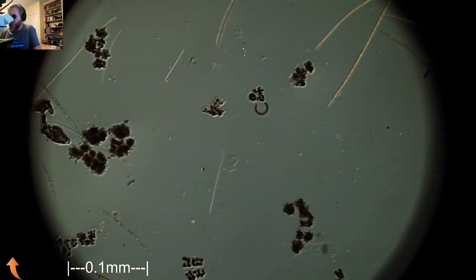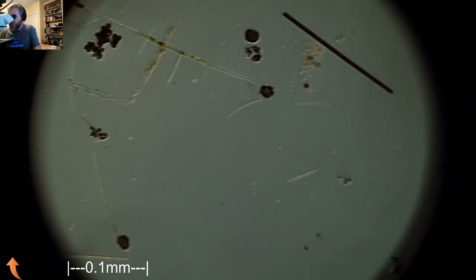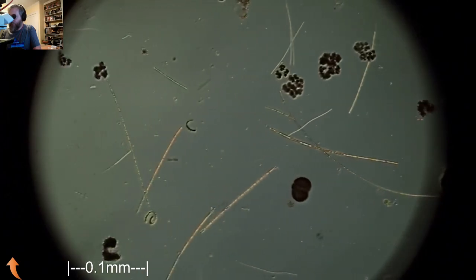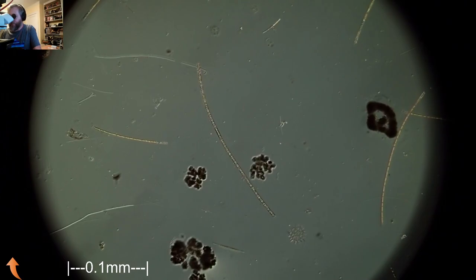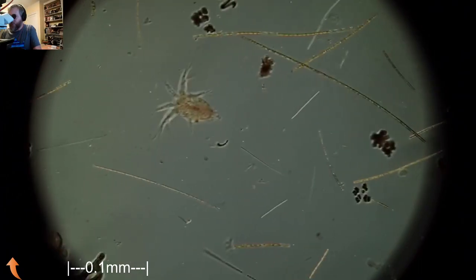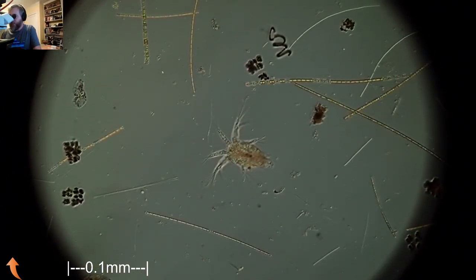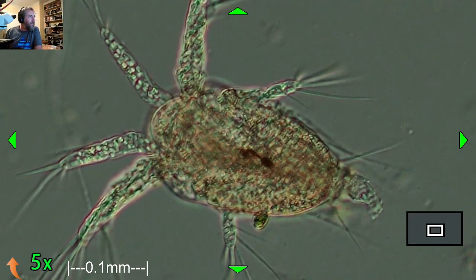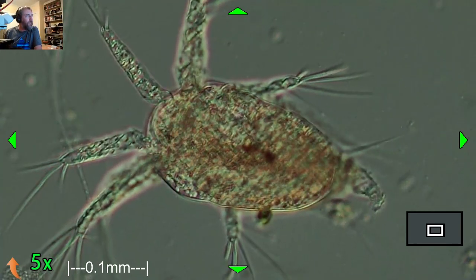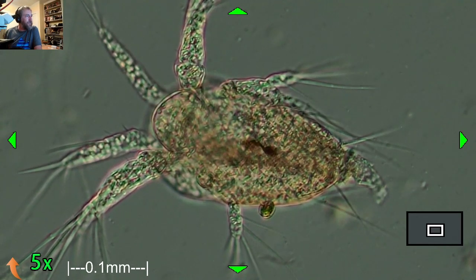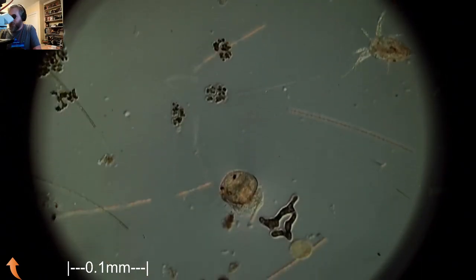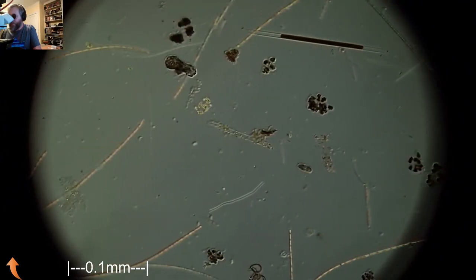And so it was nice that we were able to go out and make a pit stop and collect some of this material for her. And then she was super excited today when she was looking through all the different algae that are in the plankton because in the fossil record, none of this stuff exists except for the diatoms, really. Okay, that is another dinoflagellate right there. And then eggs of some kind. Yeah, it's a fun sample just because it's got so many different types of algae all together, you know. The diatoms are in here, but they're just one component of what's actually in the water.